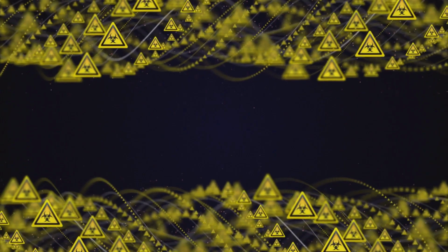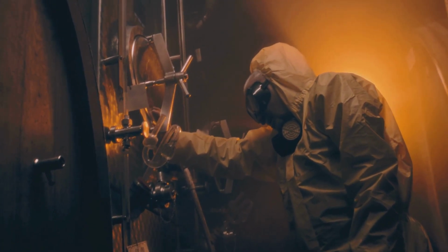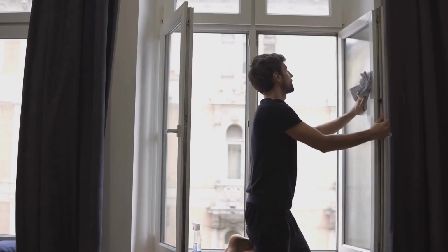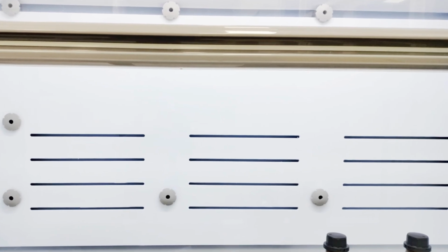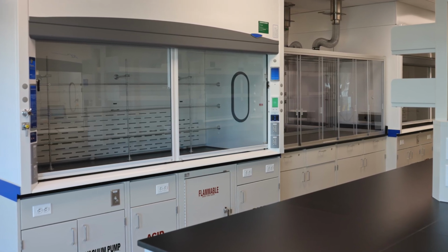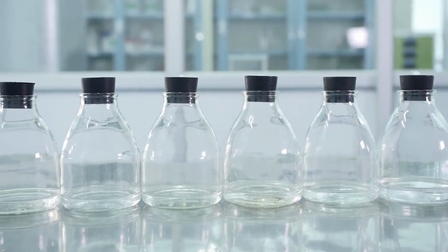So how do we handle these powerful liquids safely? Well, it all starts with one of the most important rules: ventilation, ventilation, ventilation. Always work in a well-ventilated area. If you're inside, open windows, open doors, use a fan to keep fresh air moving. In a lab, use a chemical fume hood. Good airflow disperses hazardous vapors, reducing the concentration you might breathe in. It lowers the risk of toxicity and flammability by preventing vapors from building up. Never work with solvents in a small, enclosed, unventilated space, like a closet or bathroom.